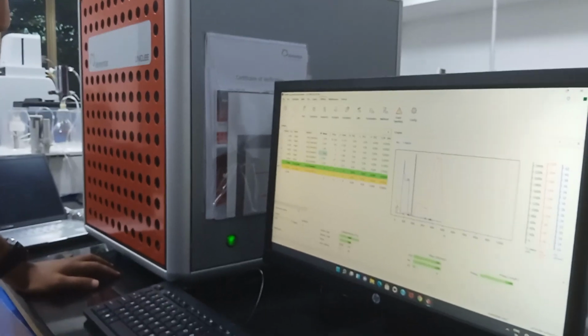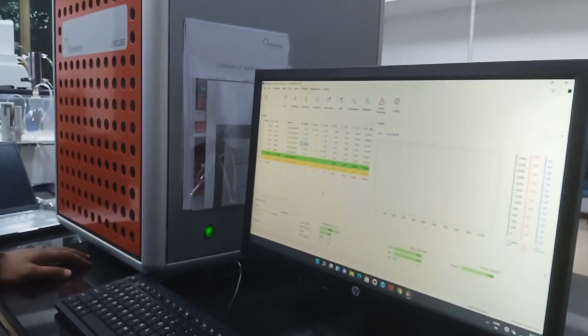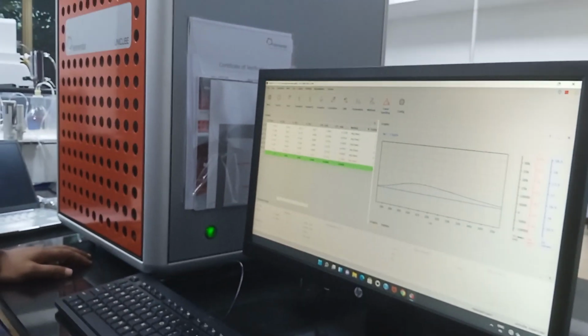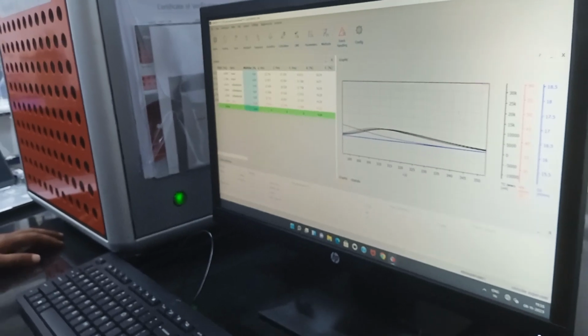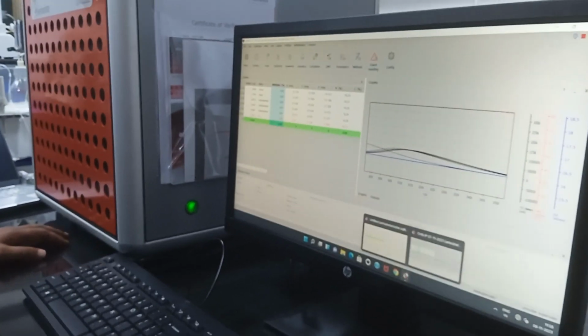And you have moisture, that also you can get here. If you know the moisture percentage, you can put it in and get the corresponding result as per that. For that, we need a fresh weight and a dry weight.